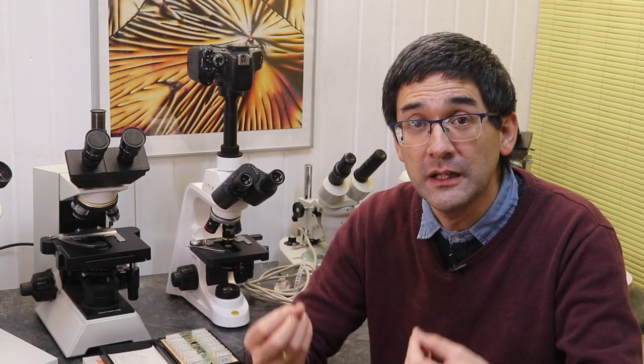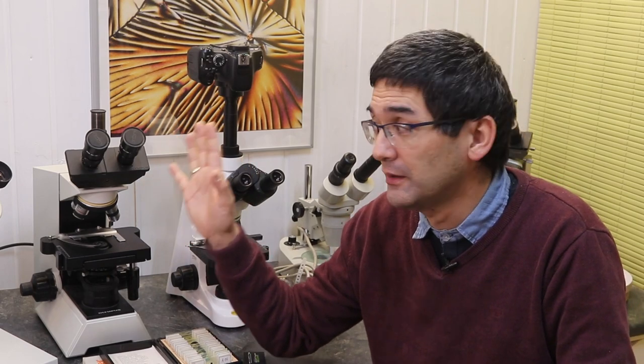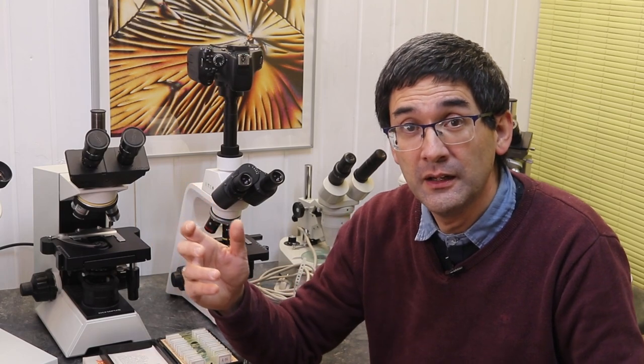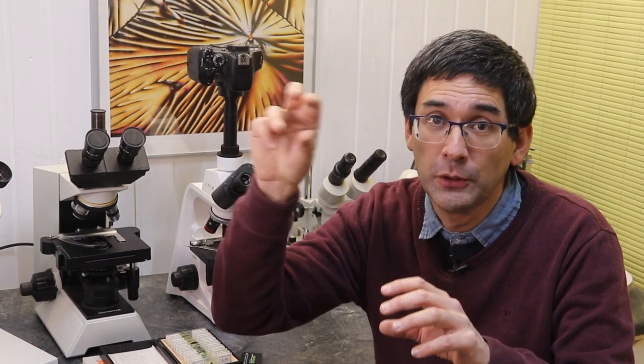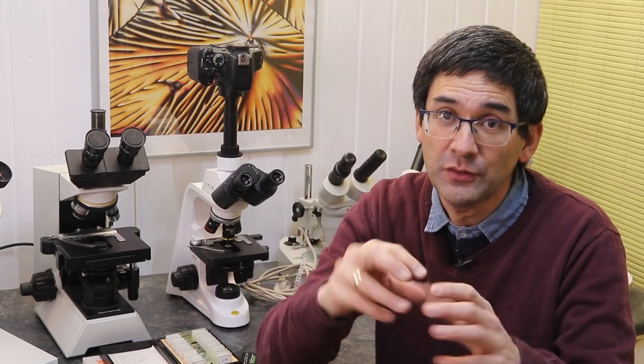Now, this might not always be a very strong effect. It depends also a little bit on the field of view of the eyepieces, because if the eyepieces have a larger field of view, you might see more of the corners. However, it is not a big difference. And especially when you are just using the microscope for looking and not for photography, it really might not make a huge difference. Because the part that you're looking at is always in the center anyway. So if there's something a little bit off to the side, you're going to move it into the center and then you're going to refocus and it's in the center anyway. And it will be crisp.